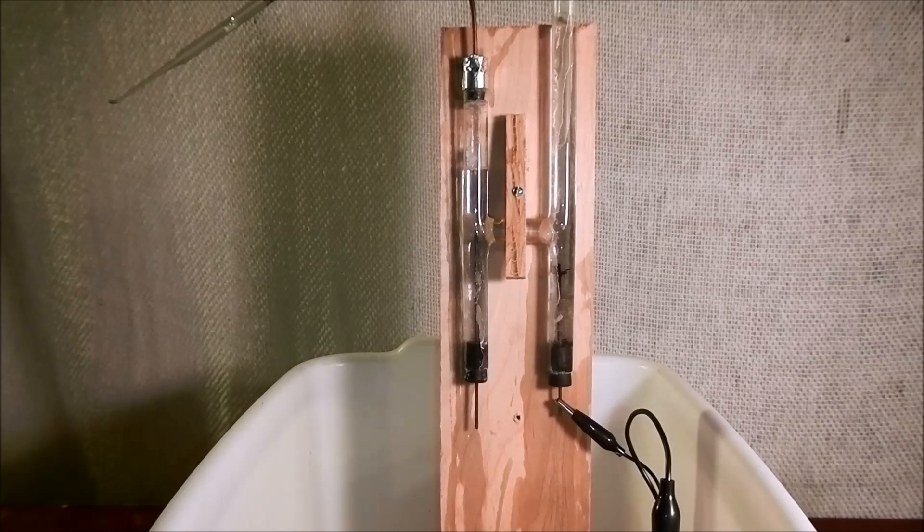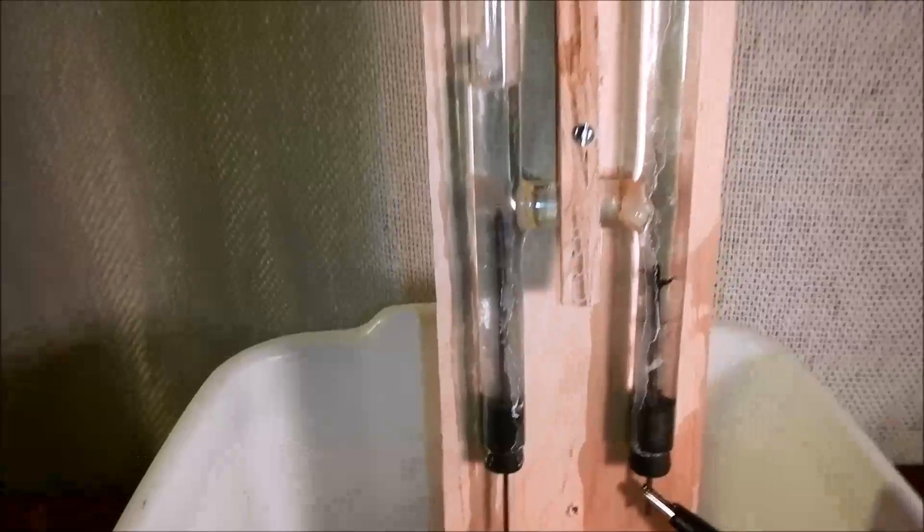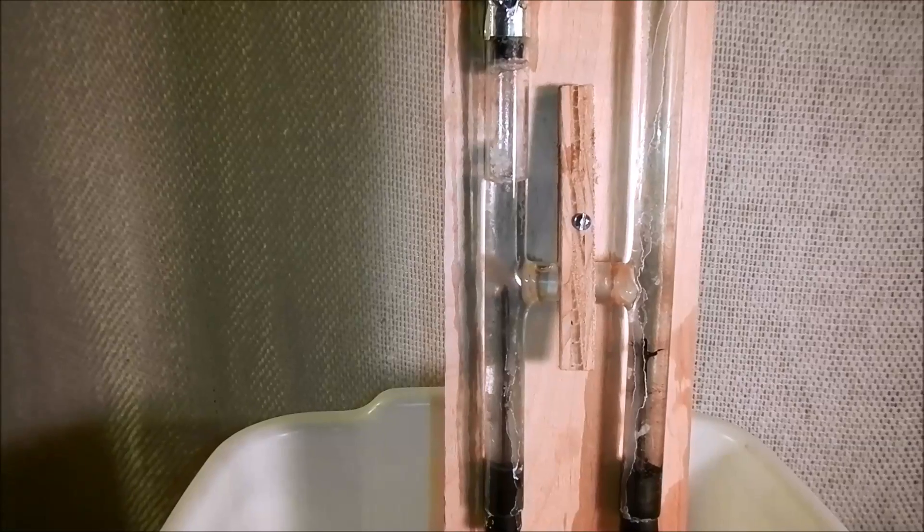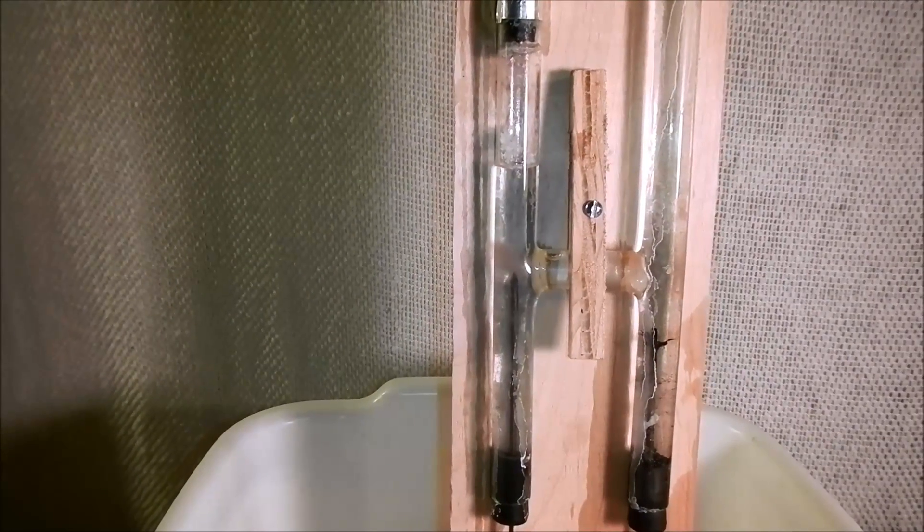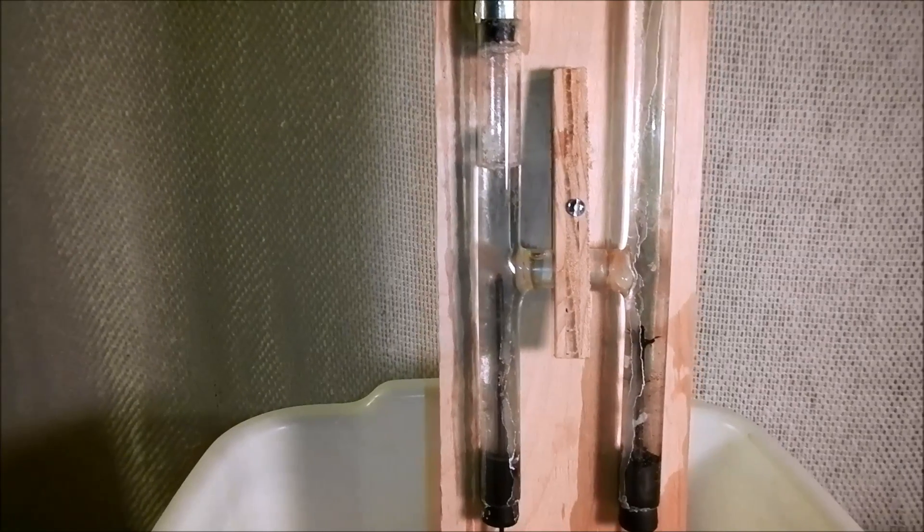Okay, I just wanted to share my do-it-yourself Hoffman apparatus. The Hoffman apparatus is a kind of H-shaped glass tube that allows you to separate hydrogen and oxygen, the basic components of water.